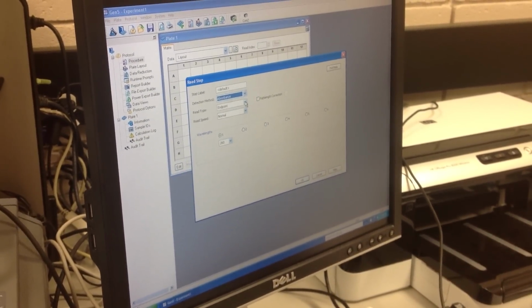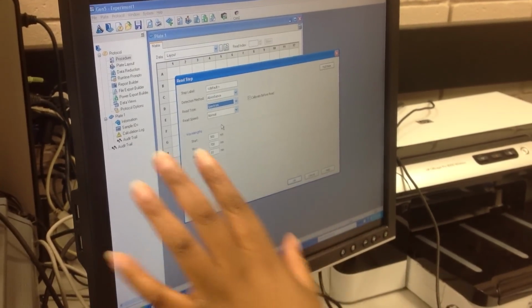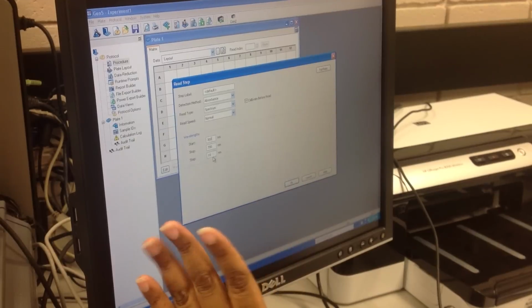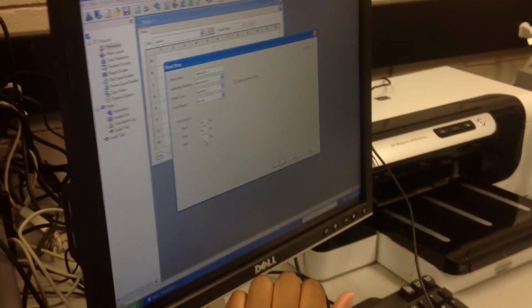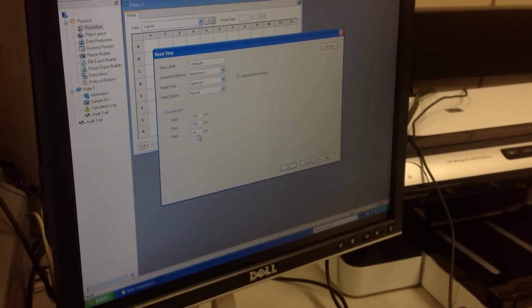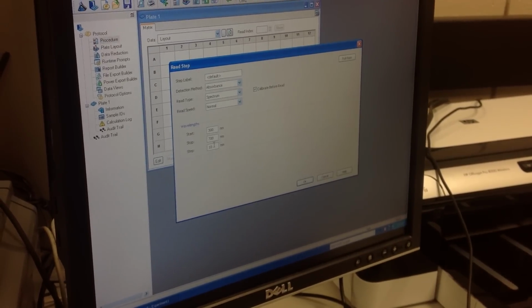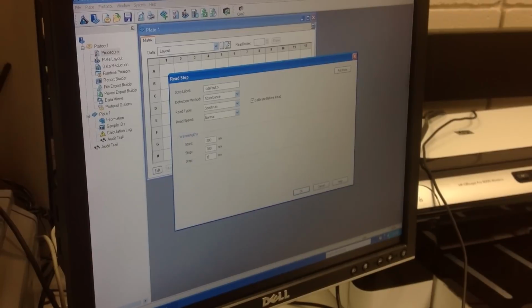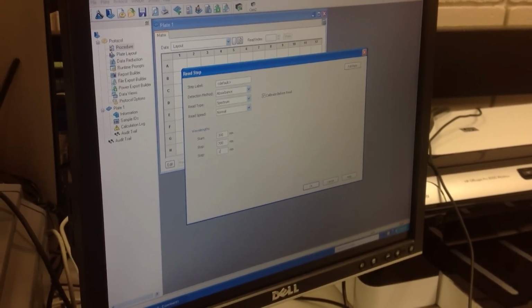We don't want that. We want a spectrum. We want to do the whole wavelength range. We want it to start around 300 nanometers and stop around 700, which is fine. It'll give us enough range to see what we're looking for. And since we're trying to find out the delicate differences between each batch of particles, we're going to do all the way down to 1 nanometer. That's called 1 nanometer resolution. So we're measuring the wavelength of every single nanometer.